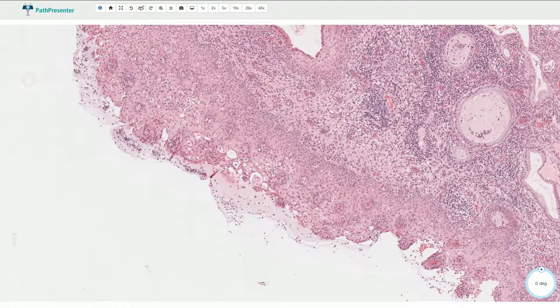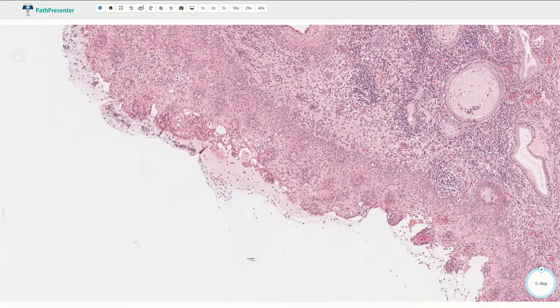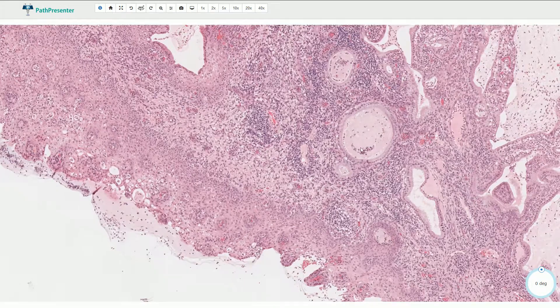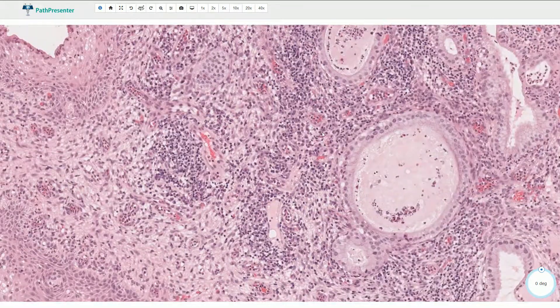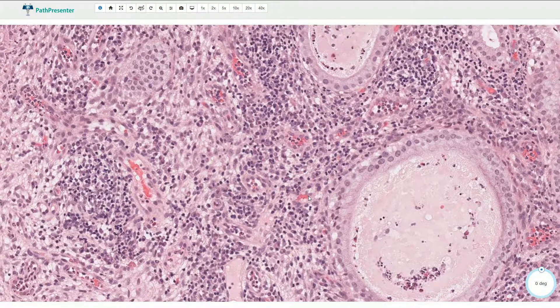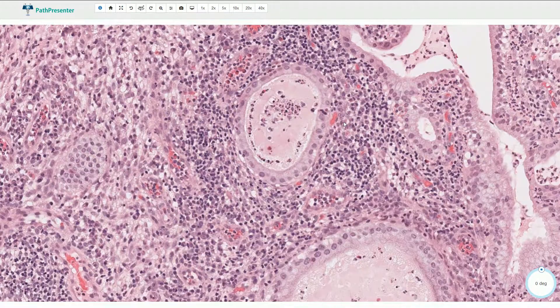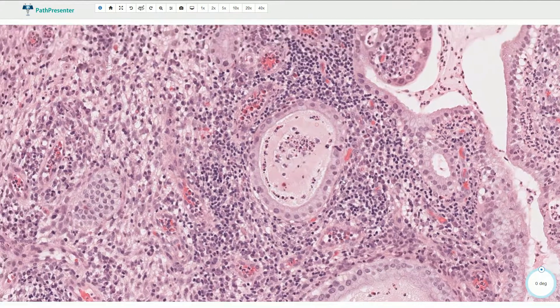The surface of the polyp can be quite irregular. It can be associated with frond-like formations. In this part we can see prominent chronic inflammation composed of lymphocytes and plasma cells, and in this area it is also associated with acute inflammation.